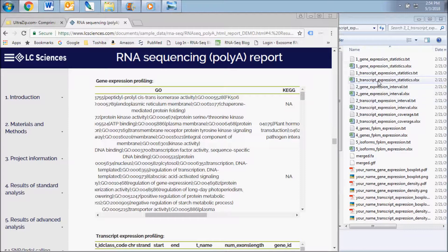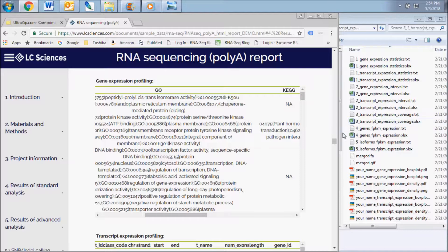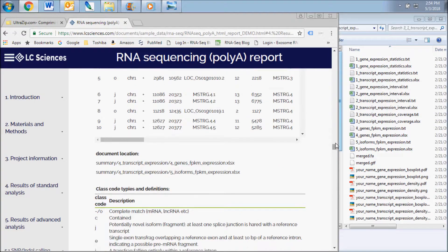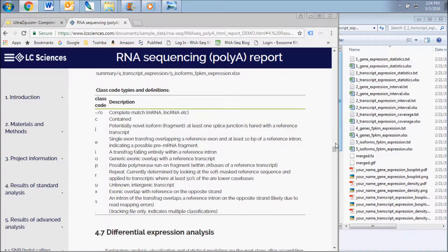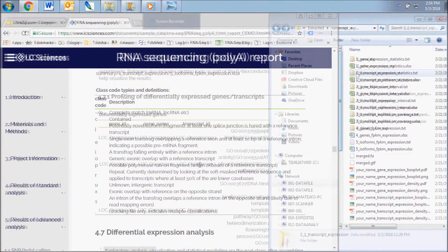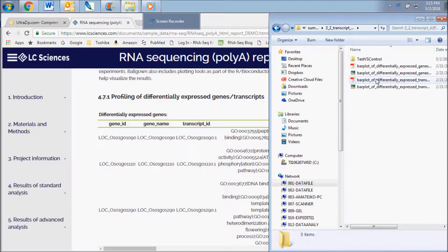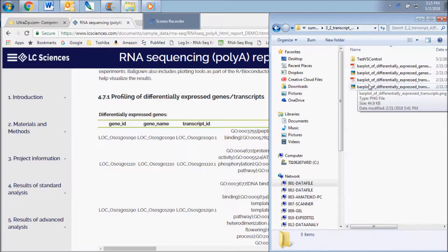Look below the transcript expression chart for class codes and definitions of the different types of transcripts sequenced. The next results subsection displays the data contained in the transcript differential expression folder. It includes the differential expression of genes and transcripts between samples.